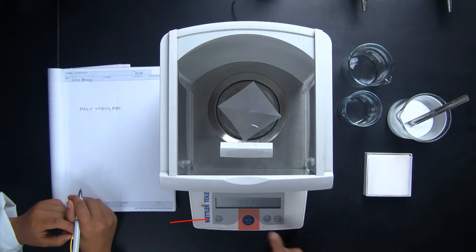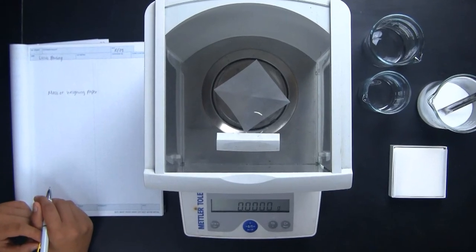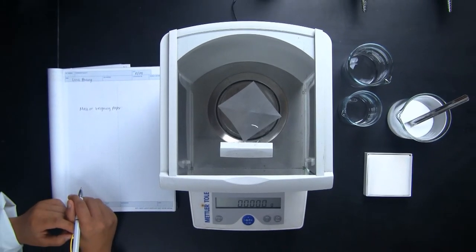Now, when the weighing paper is on the balance pan, Ash hits the zero or the tare button. And this will re-zero the balance with the weighing paper on the pan. Notice how the reading is zero and the weighing paper is on the balance pan. Now anything that is added to the weighing paper will be measured by the balance.